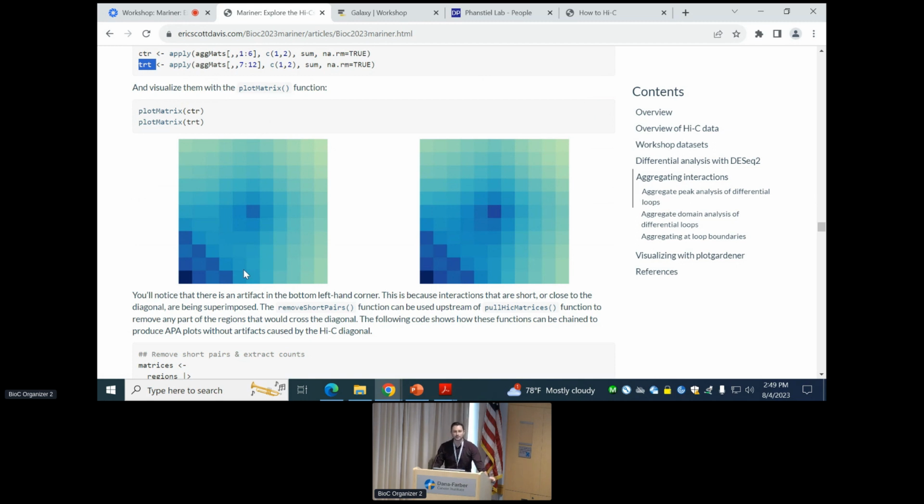When you're plotting those 2 panels separately, are you able to specify the range of the color scale to make sure you're looking at exactly the same thing across? Yes, absolutely. Good point. As I plotted them here, they're just plotting to the max and min, so there's no consistency being applied here. In just a few more minutes, I'll show you how to do that. Good question.